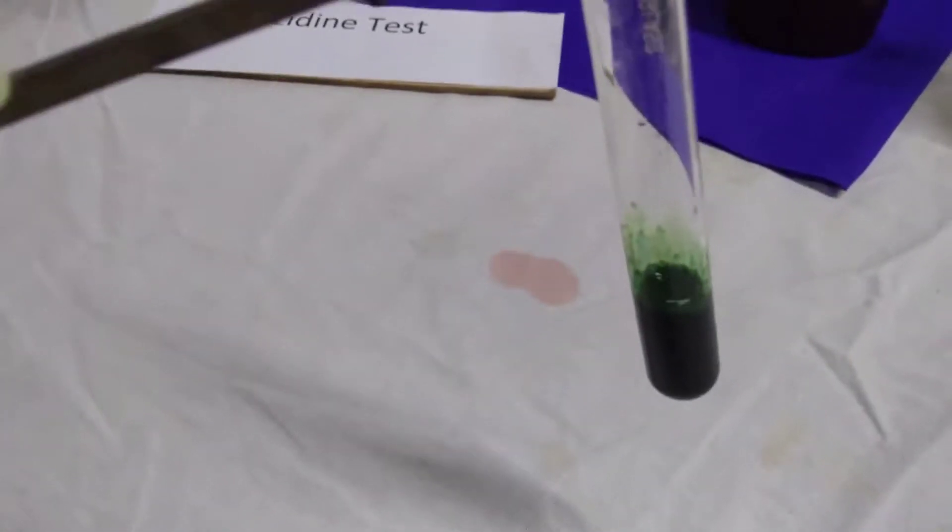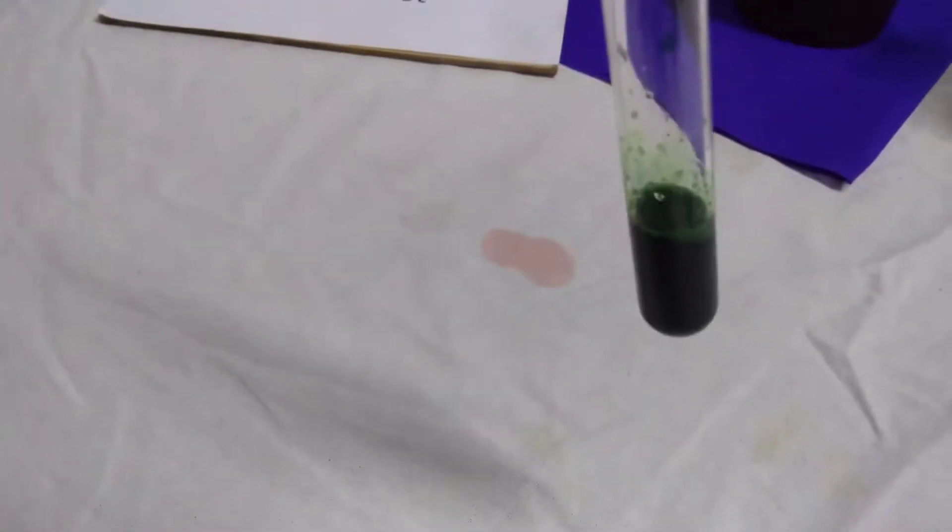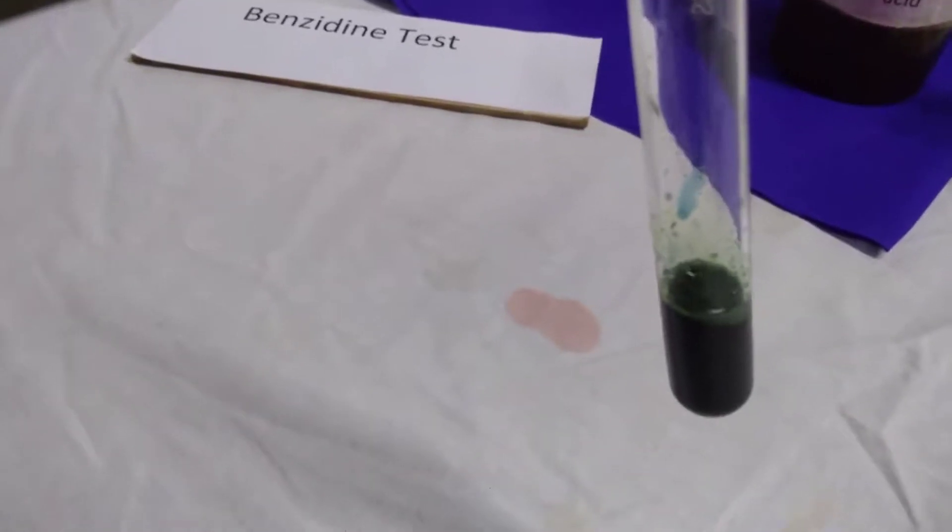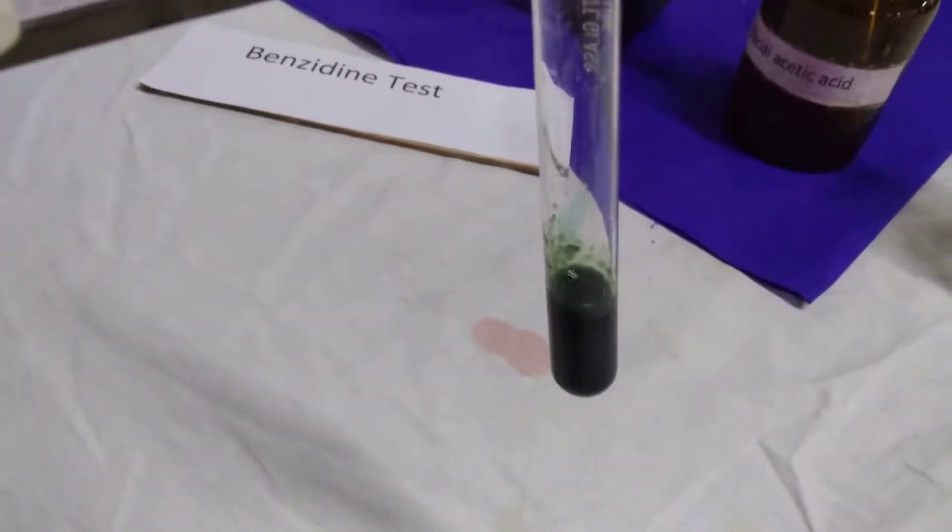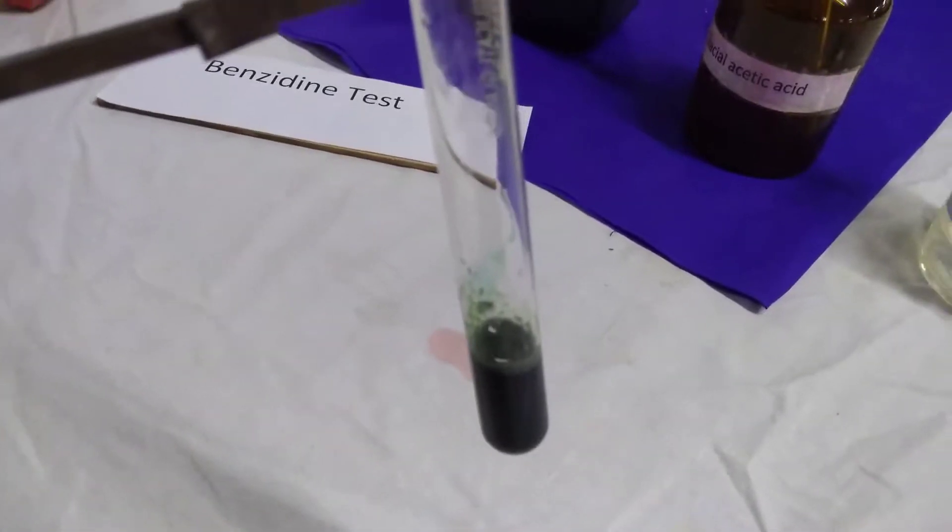The principle behind this test is: peroxidase released from RBCs due to destruction acts on hydrogen peroxide to liberate oxygen, which oxidizes benzidine to a colored compound. After a few minutes, you can see the solution has turned black.